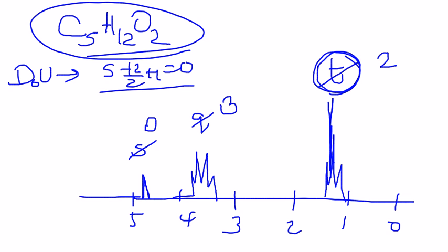But the fact that here you have one which is not connected to any neighboring hydrogens, I'm going to put that as a CH2, which is connected to perhaps 2 oxygen atoms, because carbon is supposed to make 4 bonds, and right now I'm putting it as a CH2, and that is reflective of the fact that these particular hydrogens are going to show up very deshielded, and they are connected to no other hydrogen atom.